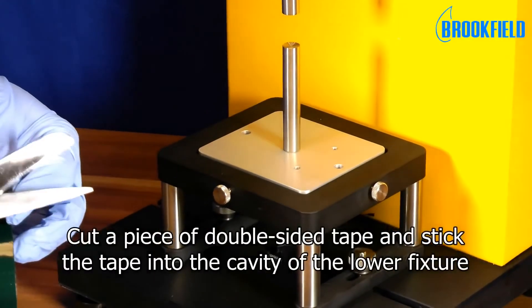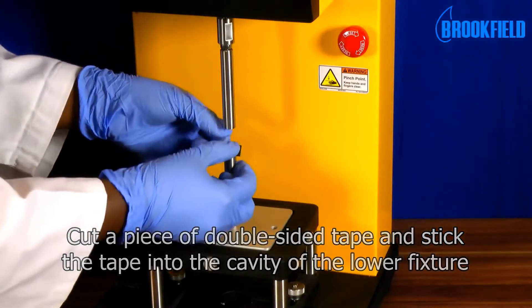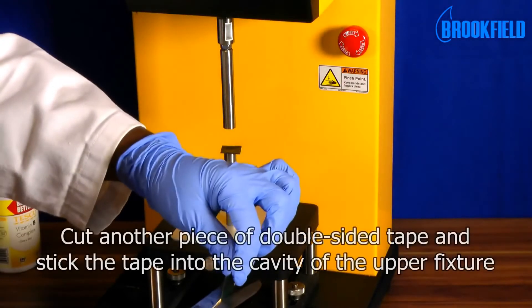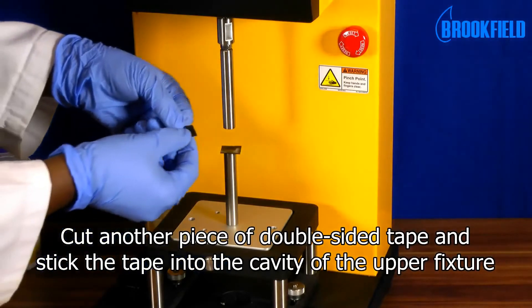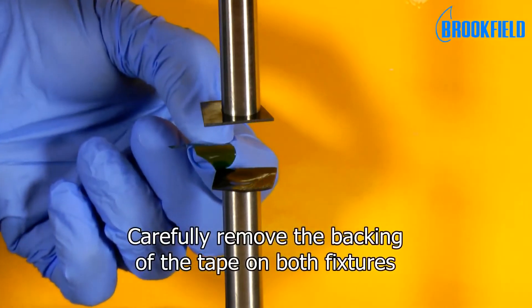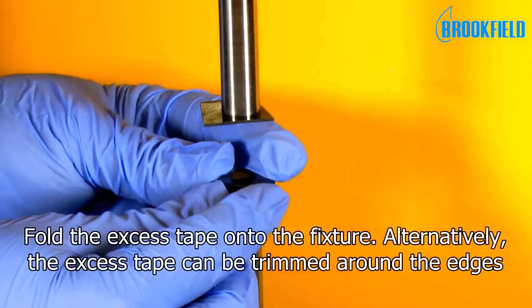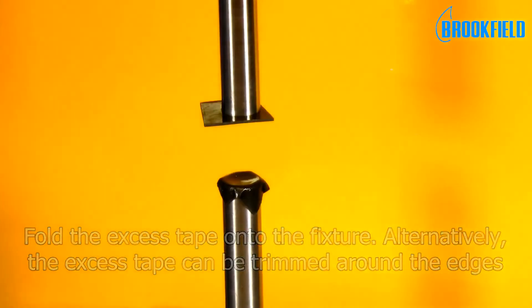Cut a piece of double sided tape and stick the tape into the cavity of the lower fixture. Cut another piece of double sided tape and stick the tape onto the cavity of the upper fixture. Carefully remove the backing of the tape on both fixtures. Fold the excess tape onto the fixture. Alternatively, the excess tape can be trimmed around the edges.